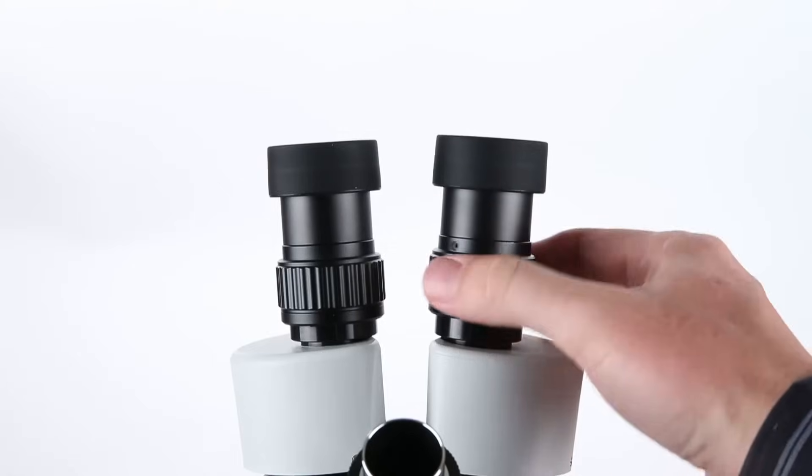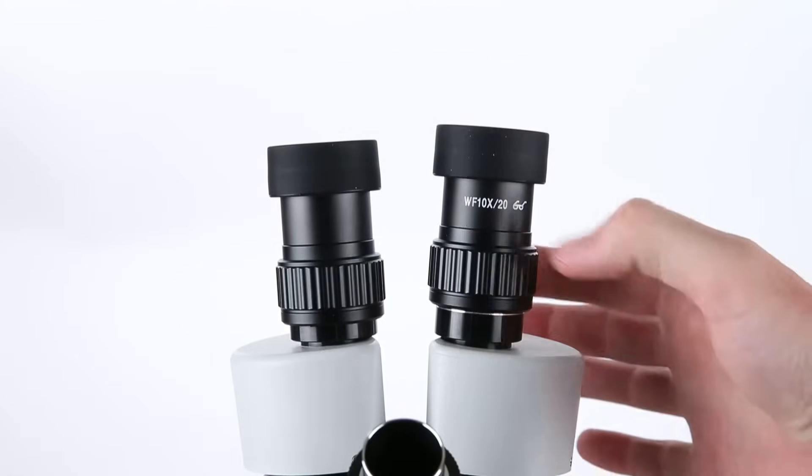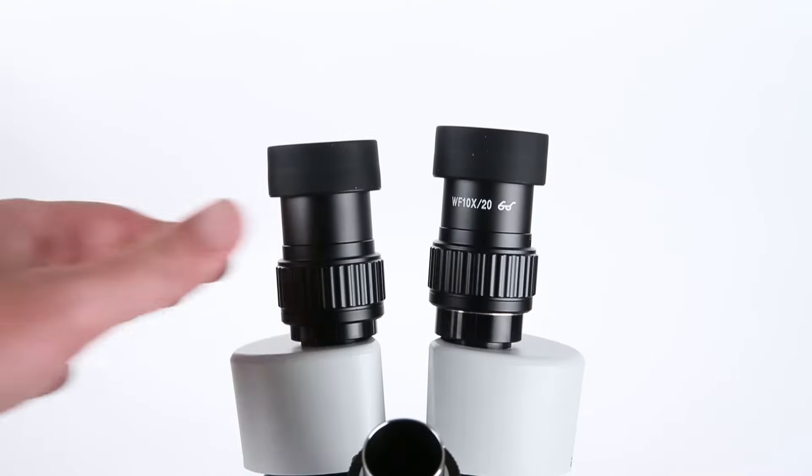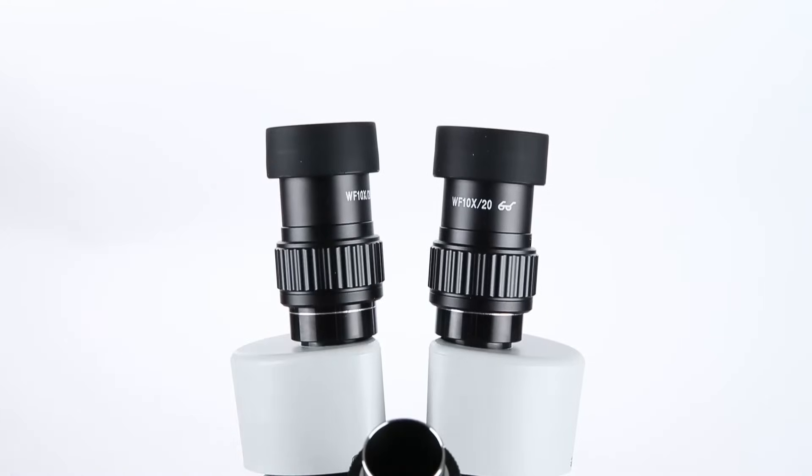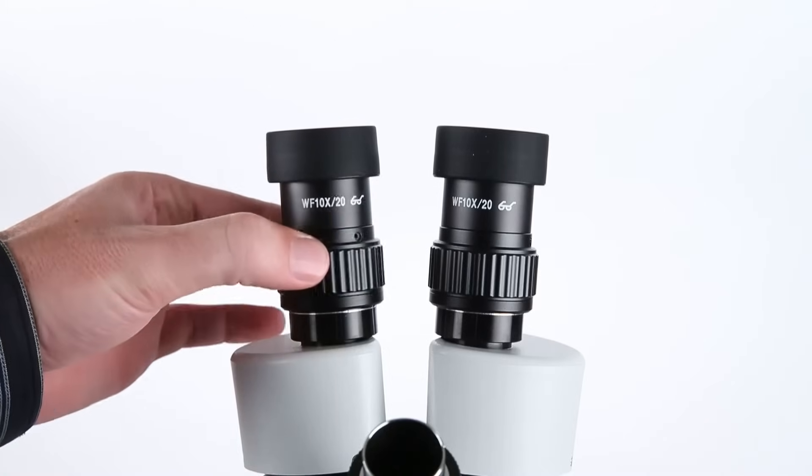On the SM2 Series head, each ocular tube has a diopter for independent focus adjustment. Each ocular tube has a silver ring. The diopter must be set to just above that ring to maintain focus throughout the zoom range.